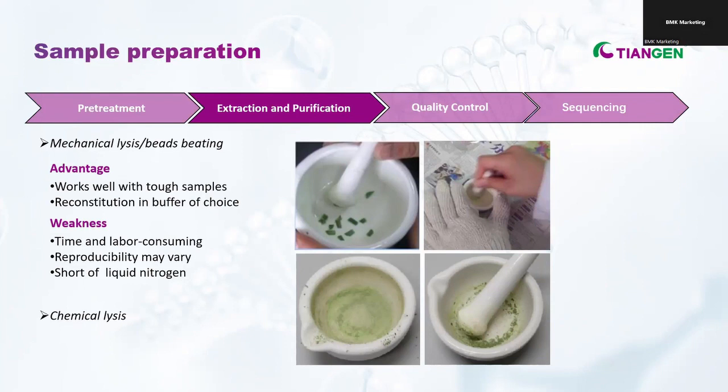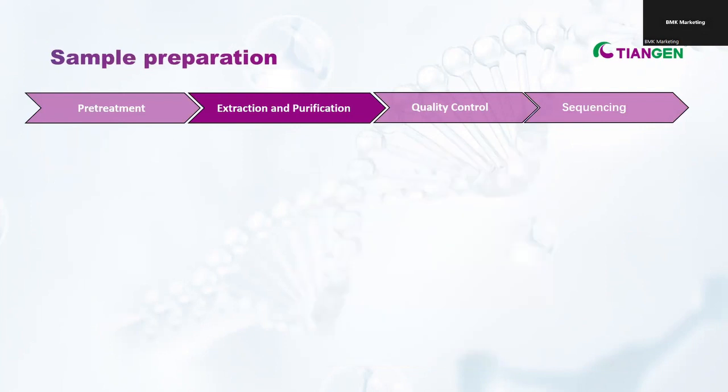So bead-beating methods are considered to produce superior yield if done optimally. Thus, for a complex bacteria sample, a bead-beating step could be performed before standard nucleic acid extraction. However, vigorous bead-beating should be avoided since it can shear nucleic acid and eventually affect the library preparation step later.